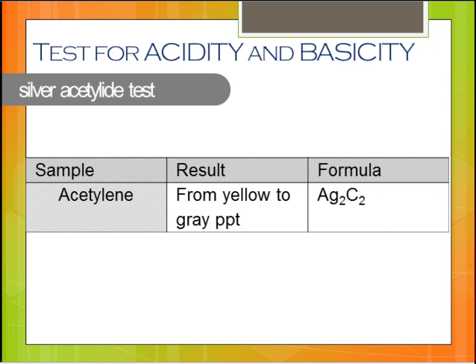Here we see the result of our experiment. The precipitate that we noted was, as the test says, silver acetylide. Okay, so here's a fun fact about what we just synthesized. Just like acetylene, silver acetylide is also a heat and shock sensitive explosive. When it is detonated, you'll notice that there is no evolution of gas as it is only composed of silver and carbon. Same precautions as acetylene should be made, otherwise this will literally blow you away. Back to discussion.